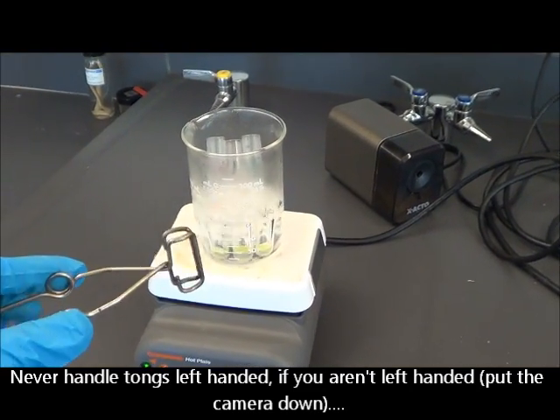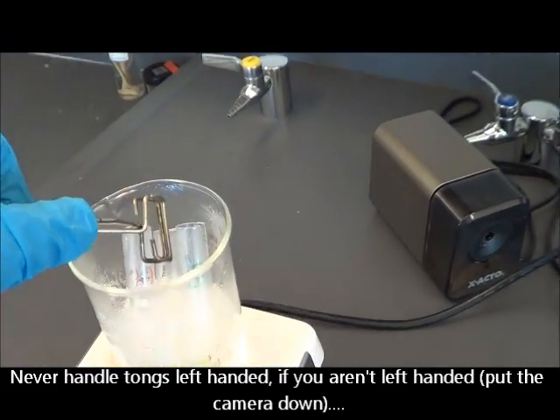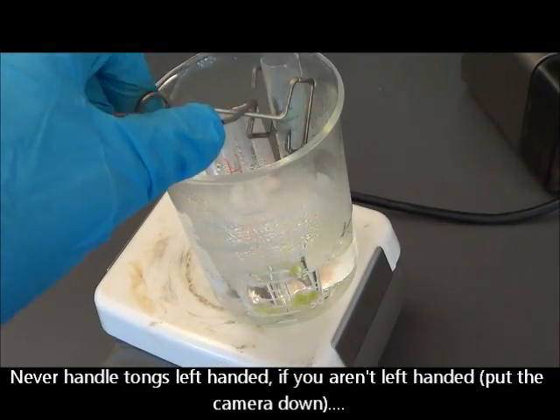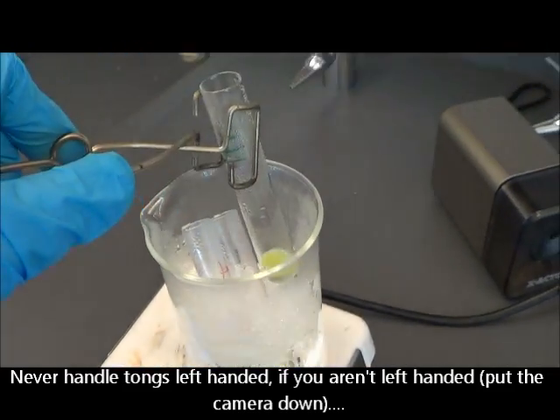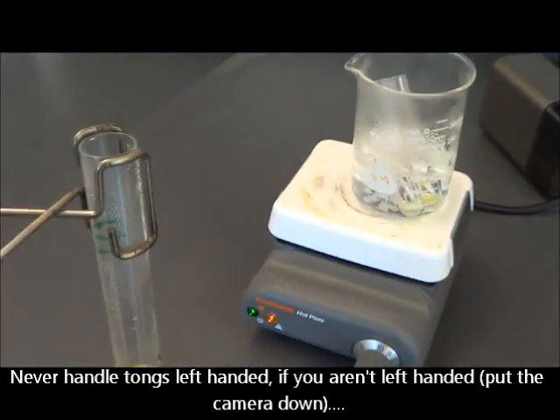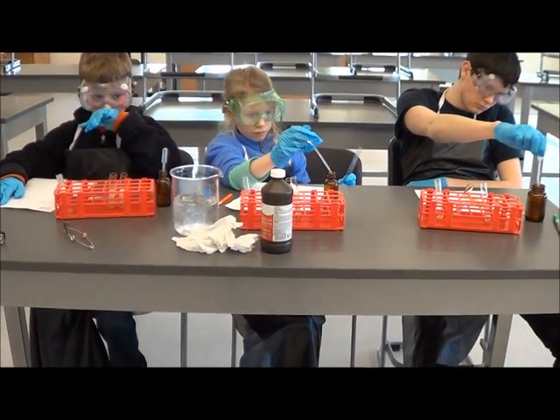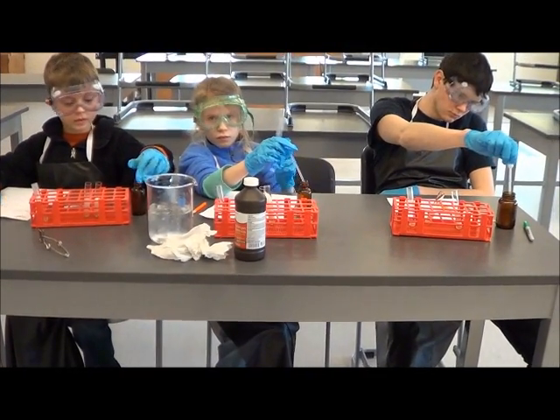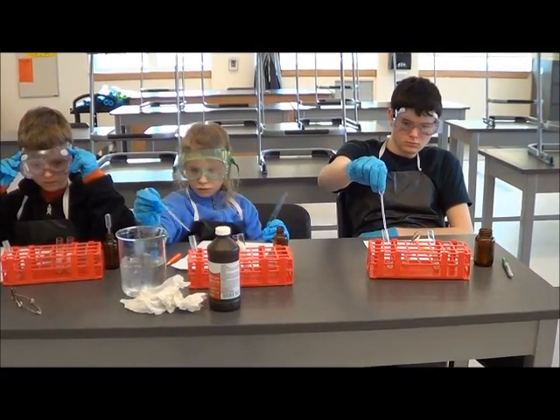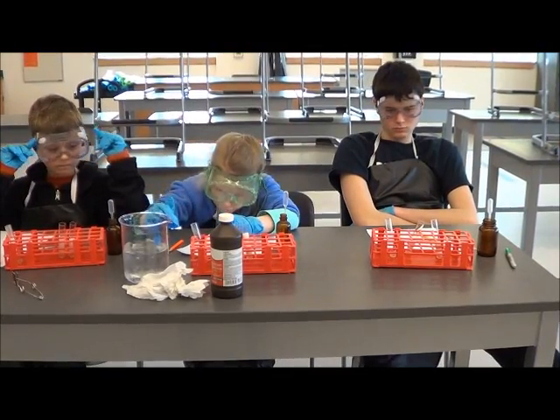When you handle hot stuff, you need to use tongs. And make sure you always point the tip of the test tube away from yourself. So now you're not touching the hot test tubes with your fingers, right? You're just going to use the hydrogen peroxide — get one milliliter of it and put it in. And then we're going to wait one minute.